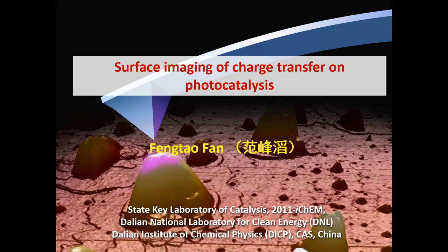So today, I'm very happy to give you a talk on a recently developed technique called surface photovoltage spectroscopy. This technique is set up on the Dimension Icon, due to its open architecture, as Dr. Huang has mentioned. So the title of my talk today is Surface Imaging of Charge Transfer on Photocatalysis. And my name is Fengtao Fan from the Dalian Institute of Chemical Physics.